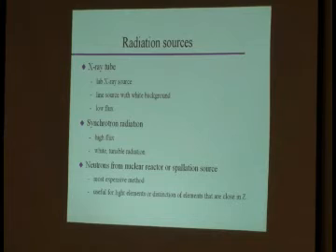And then of course there are neutrons. You can use 2 sources, a nuclear reactor or a spallation source, to produce neutrons. This is certainly the most expensive method on this scale. Okay? However, there are times when neutrons can be very useful. For example, if you work with a lot of light elements, neutrons are actually more sensitive to light elements compared to heavy elements than X-rays, okay? Or if you have neighboring elements.